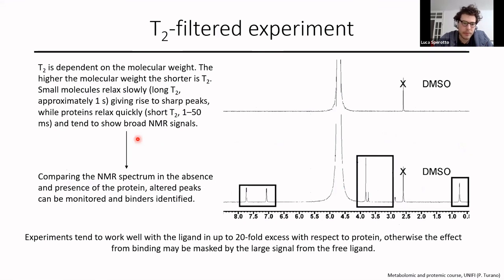And here is another way. This relies on the relaxation properties.